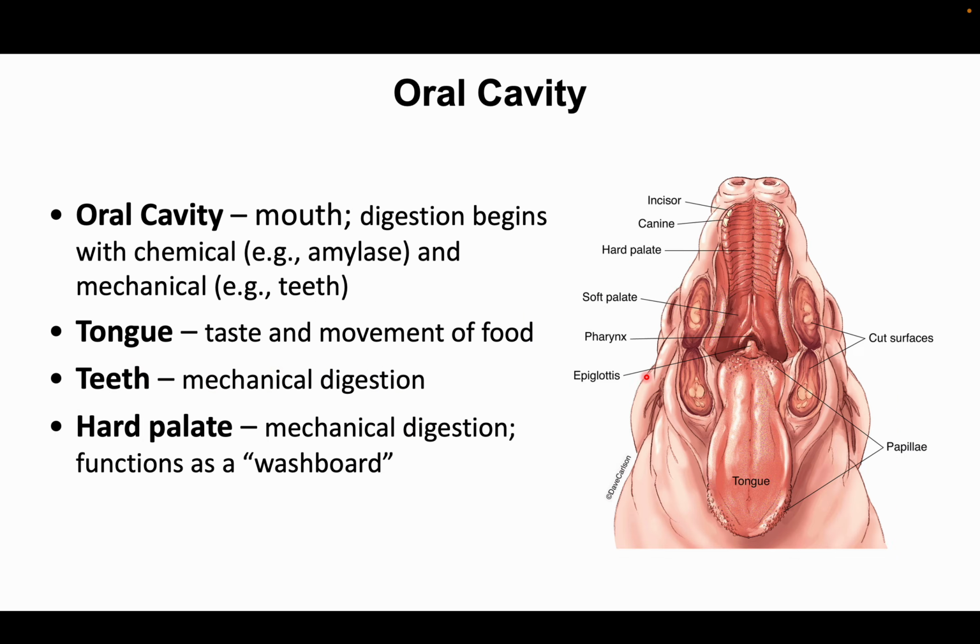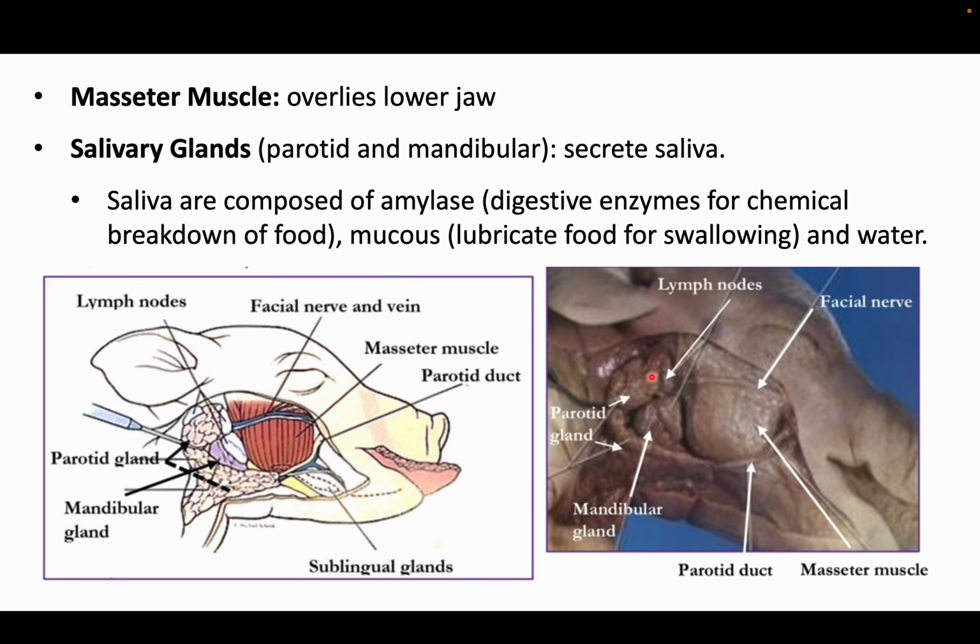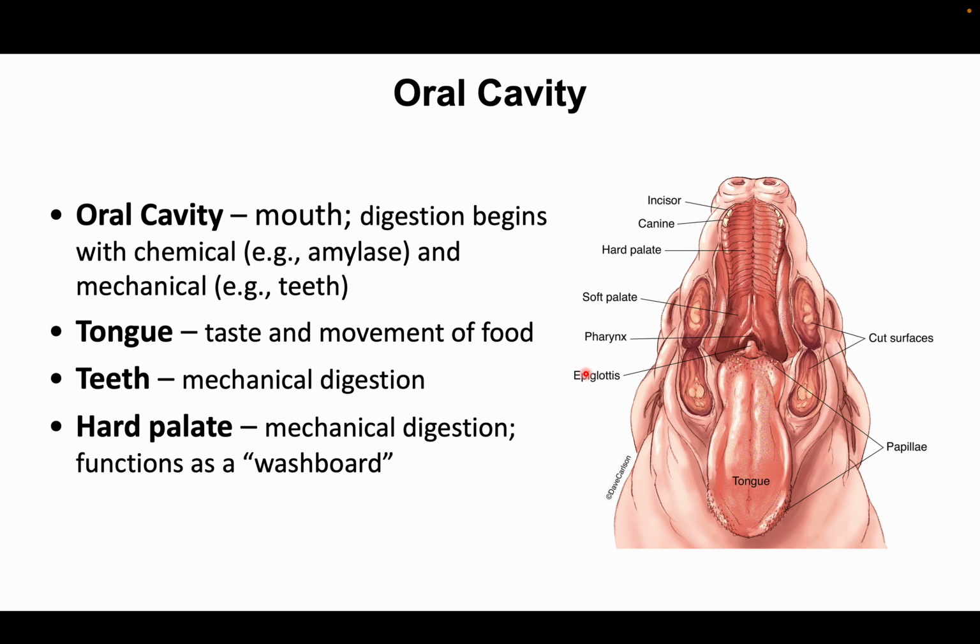And then if you want to see more of the oral cavity, what you technically have to do, going back to this cut, is take an incision and go from the angle of the lips all the way to the auricle, do it on both sides, and then you can open up the mouth to see more of the oral cavity.